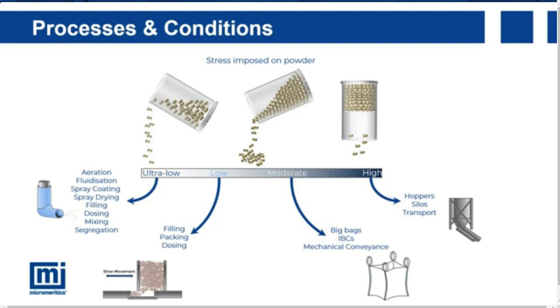However, we still don't have the full picture, as we have little idea of how our powders will respond to the imposition of outside forces, such as compression and the throughput of fluids.